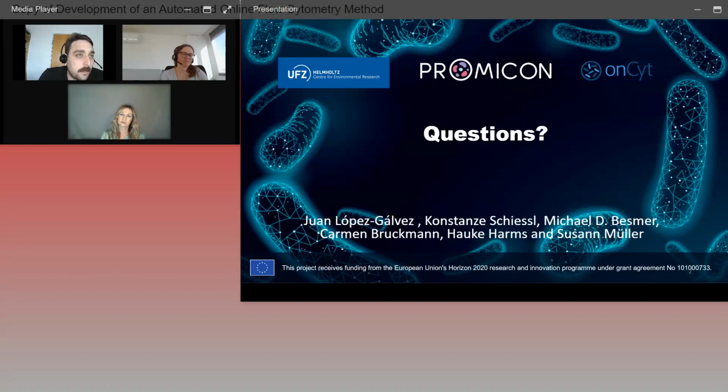And we grow them in our lab in a synthetic wastewater medium, and we analyze ecological parameters of this community, also with DAPI staining. And you can resolve 50 different, that's what you say. More than 50 different sub-communities inside the same community. Yeah, I think that's super cool because there are not many methods that can do that with environmental communities.